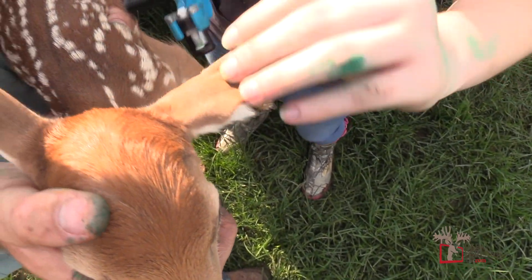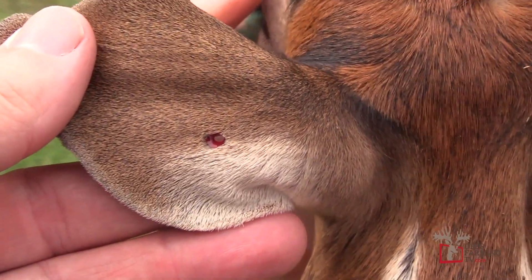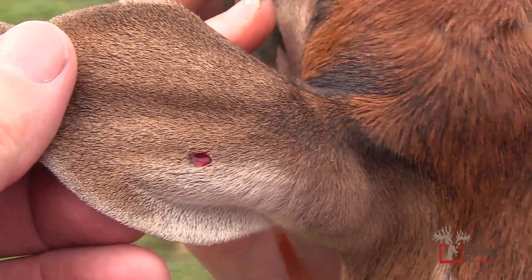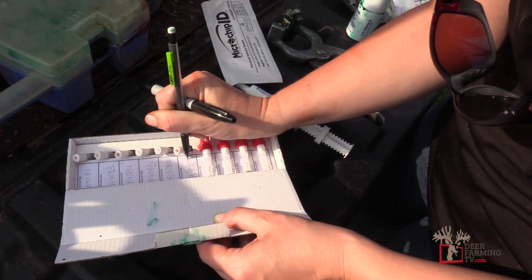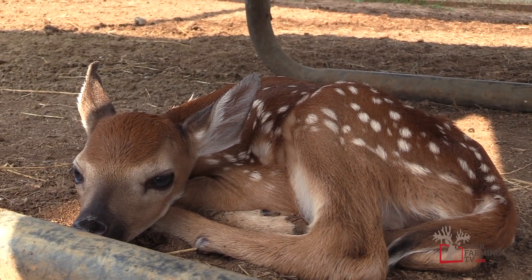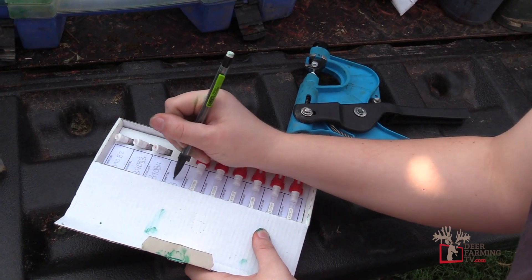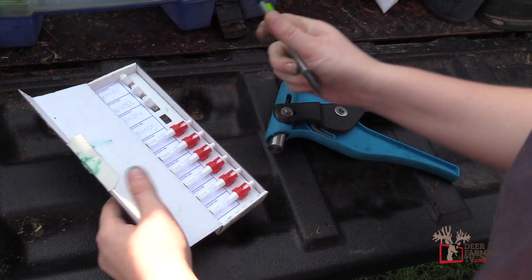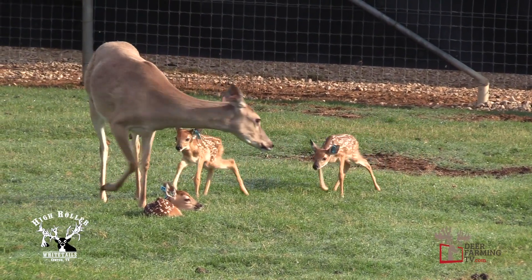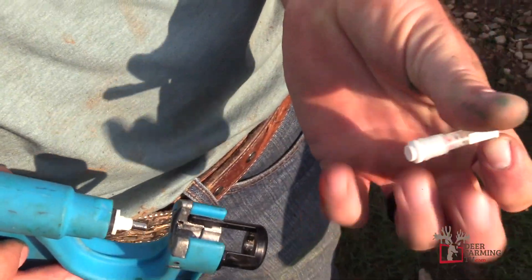So what are the benefits? Well, first of all, this gun creates a pilot hole for the ear tag. And also, when these sample tissues get to NADAR, there's no human contact with the sample. These tubes go right into their machine. NADAR told me they have a faster turnaround time — basically four days — compared to the hair sample. And these tissues in the tubes have more DNA samples than hair, which basically means if you need to run more DNA later on, they have these samples ready and available. It really takes out a lot of the steps for NADAR.